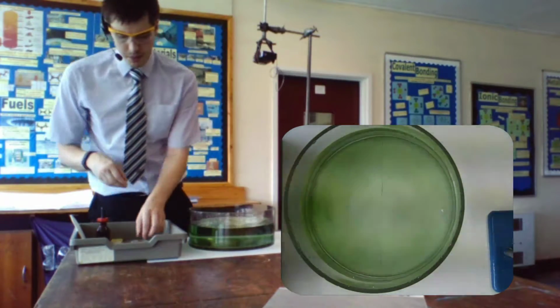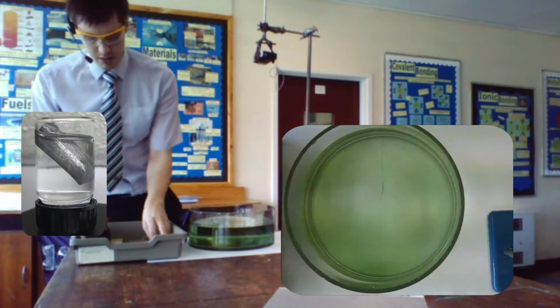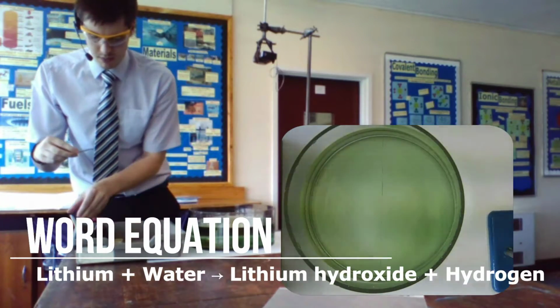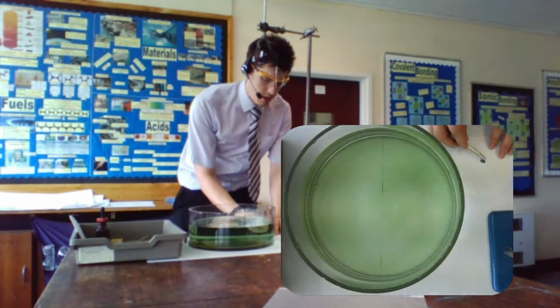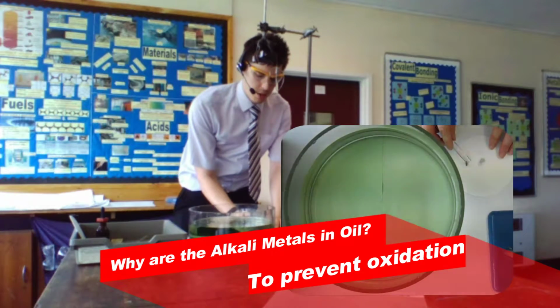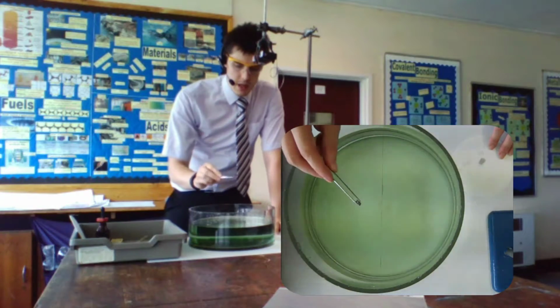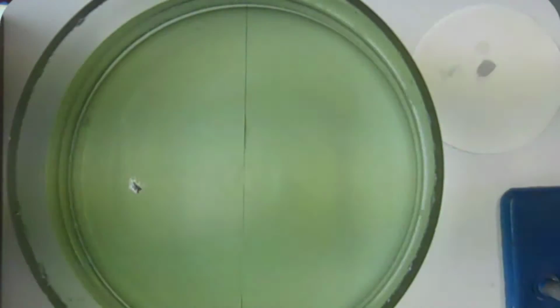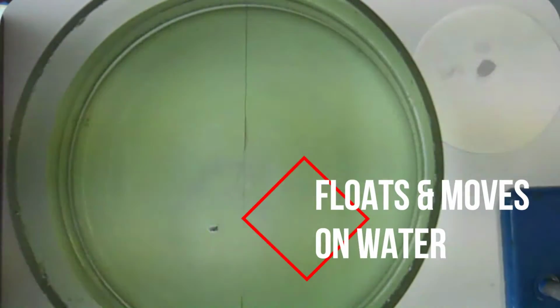Now the second thing I'm going to do is I'm going to take a piece of my lithium and I'm going to remove the oil. Now the reason that it's encased in oil is to stop it reacting with the oxygen in the air. Okay, so I've removed that now, I'm going to pop it in and we'll see what happens. So straight away you can see it's floating on the surface.